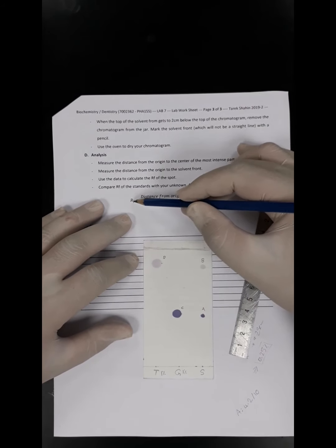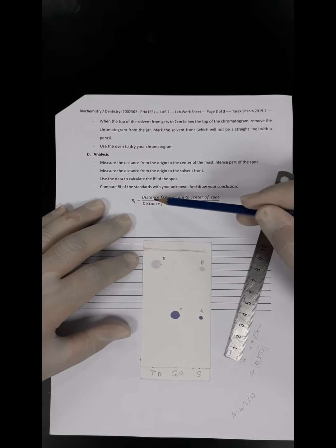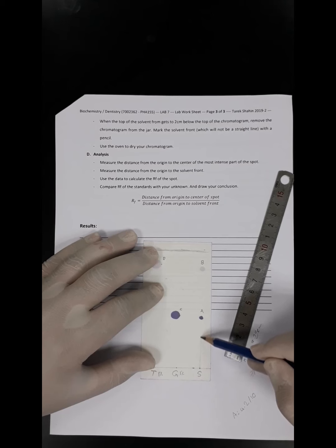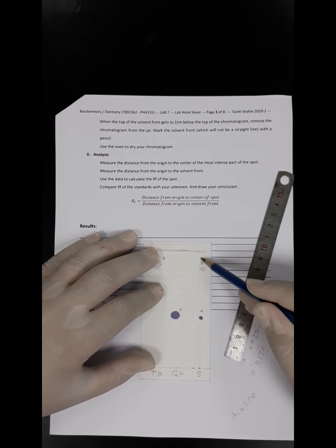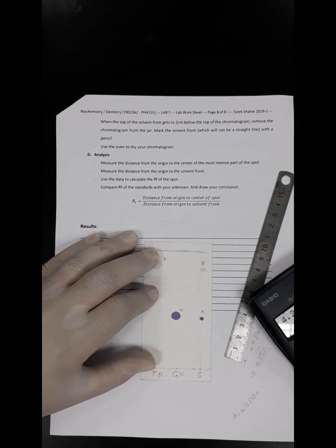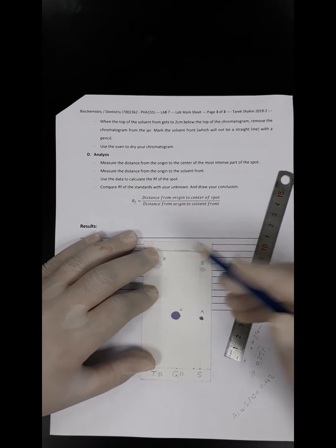So the retardation factor is calculated by dividing the distance traveled from the origin to the center of the spot by the distance from the origin to the solvent front. So it would be the distance from here to there, and then the distance from here to there. We will calculate it using the calculator. It would be 4.2 divided by 10, which is 0.42.